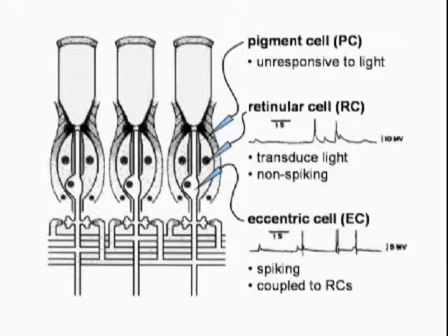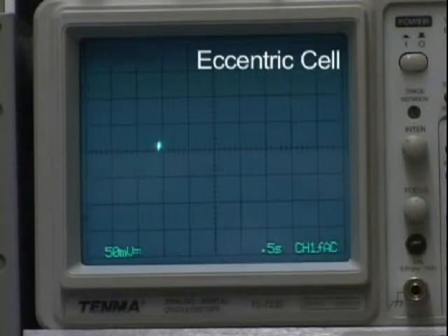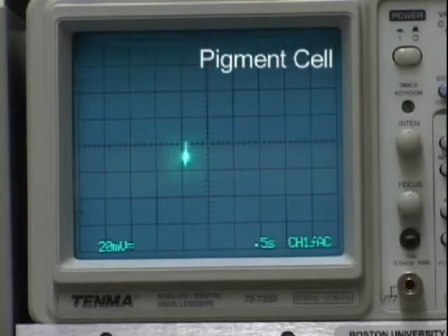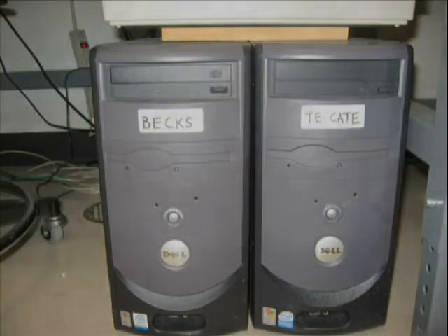Three types of cells may be encountered in the horseshoe crab eye: retinular cells, eccentric cells, and pigment cells. Retinular cells show a large depolarizing response to light. Eccentric cells show a train of action potentials riding on a depolarizing response. And pigment cells show no light responses at all. The response is observed on an oscilloscope and recorded to a computer. With intra-retinal recordings, one can study the cellular basis of vision.